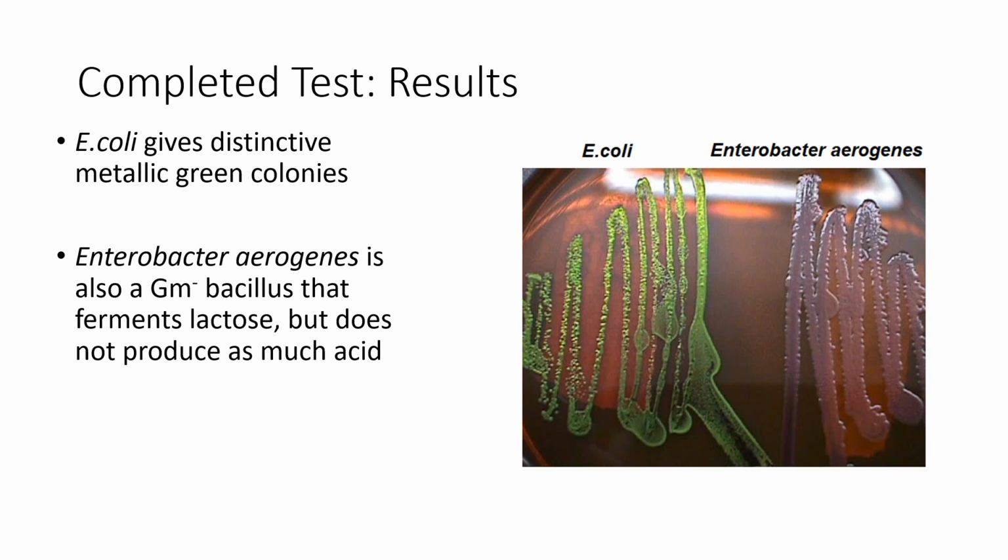It's incredible. You cannot mistake this. These are the best tests when you just look and it's like, yes, there it is. Not like you're rooting to get E. coli in your sample, but it's not one of these tests where you're right on the cusp. I don't know. Is it a yes? Is it a no? This is so obvious. You will get a metallic green colony for E. coli and E. coli only. And the reason is all those acids that E. coli makes, lactic acid, succinic acid, acetic acid, react with the eosine and the methylene blue to give you this distinctive color, this metallic green.